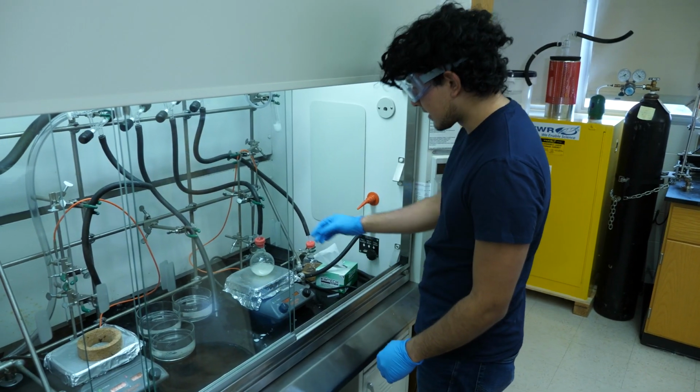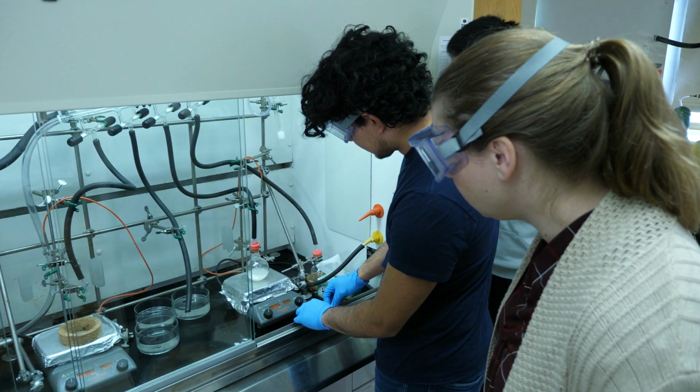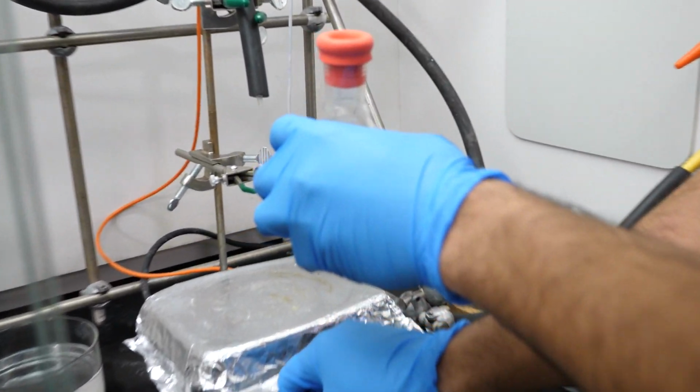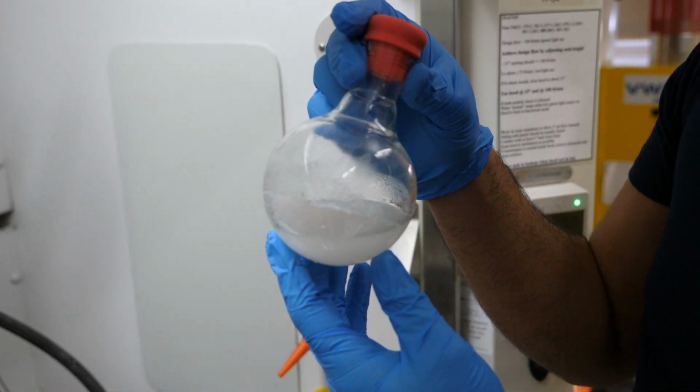So what I mainly do is polymer synthesis. My team and I are really the ones creating polymers, and we use these to test on different pieces of equipment and instruments that you see around here. And that's because what I mainly focused on was the chemistry and how we wanted to formulate our polymers for testing. And being able to do these kinds of tests, we can learn a lot more information than just studying the viscosity of the material alone.